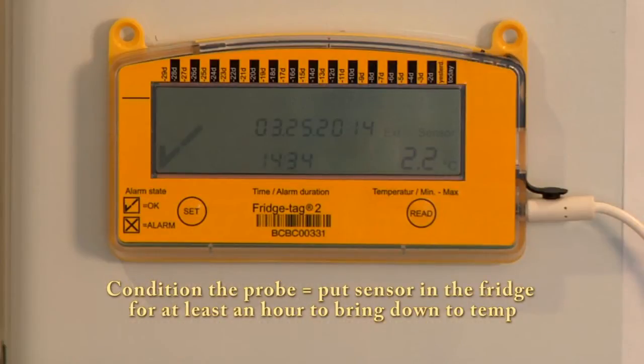It's very important to condition the probe for at least one to two hours prior to use in order to take the temperature down to the temperature within your storage unit.